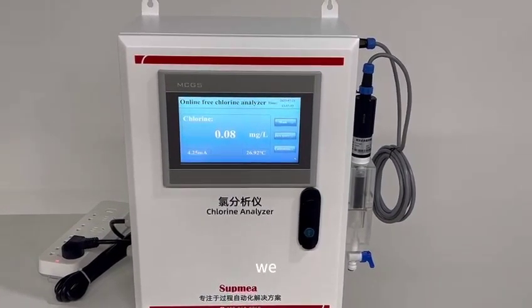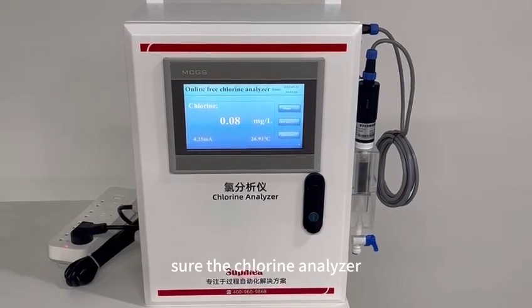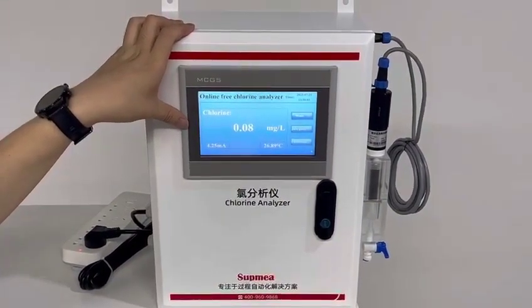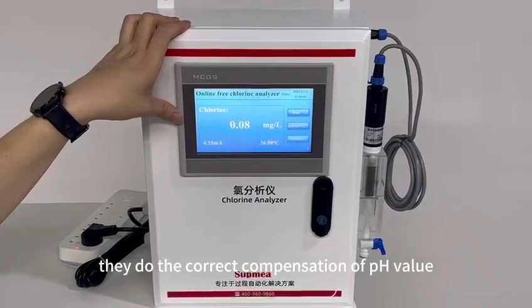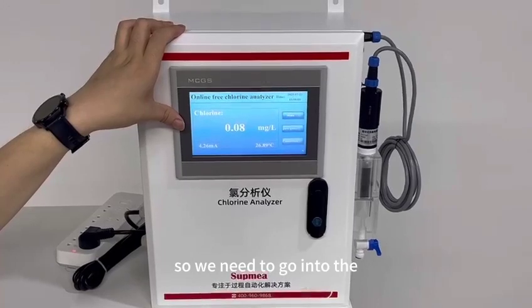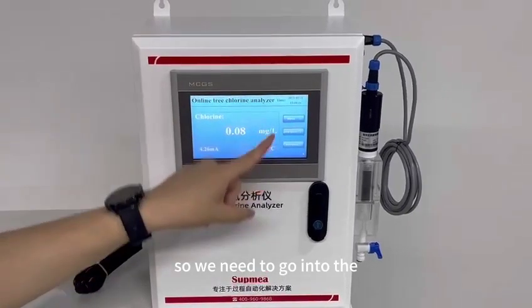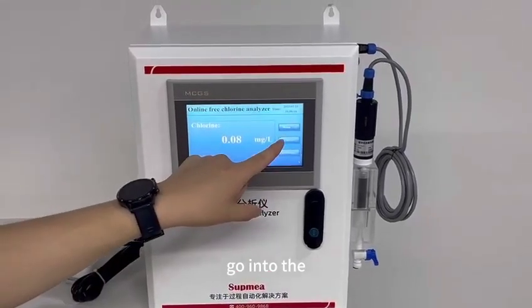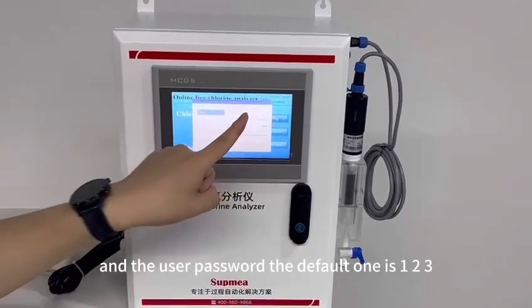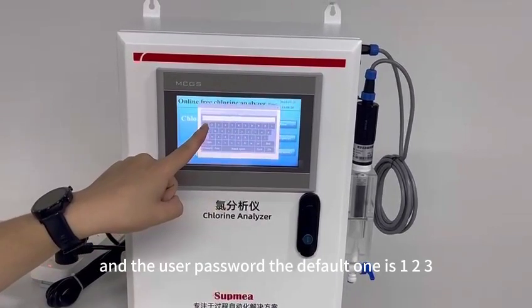Second tip: make sure the chlorine analyzer does the correct compensation of the pH value. To do this, go into the menu. The user password — the default one — is 1, 2, 3.